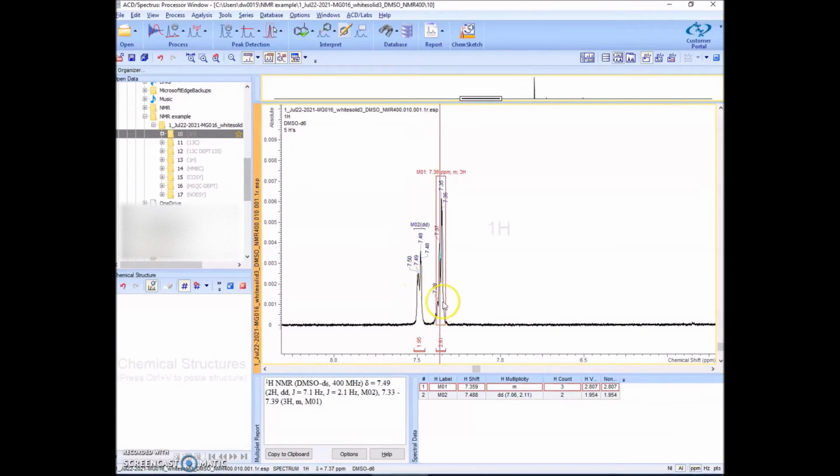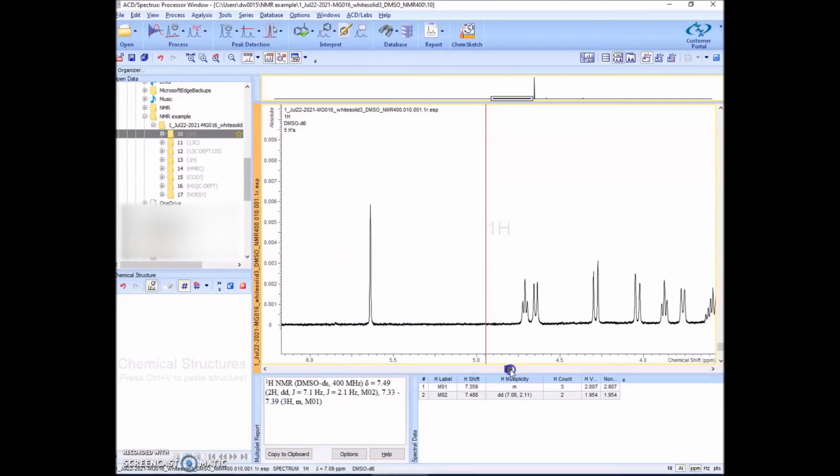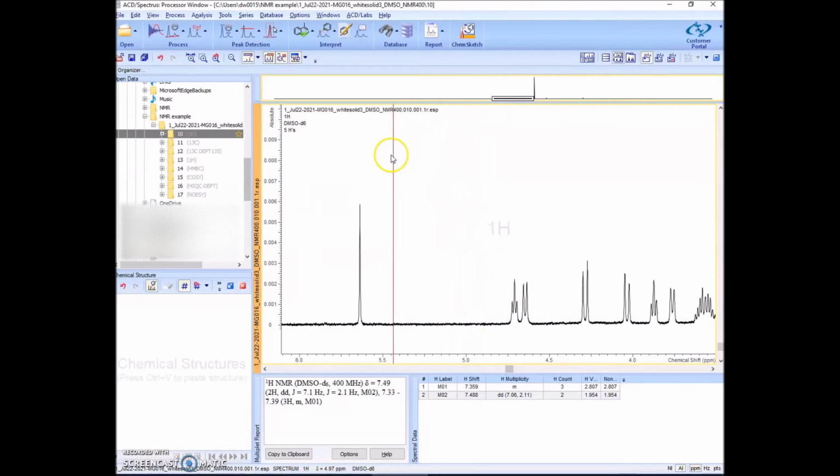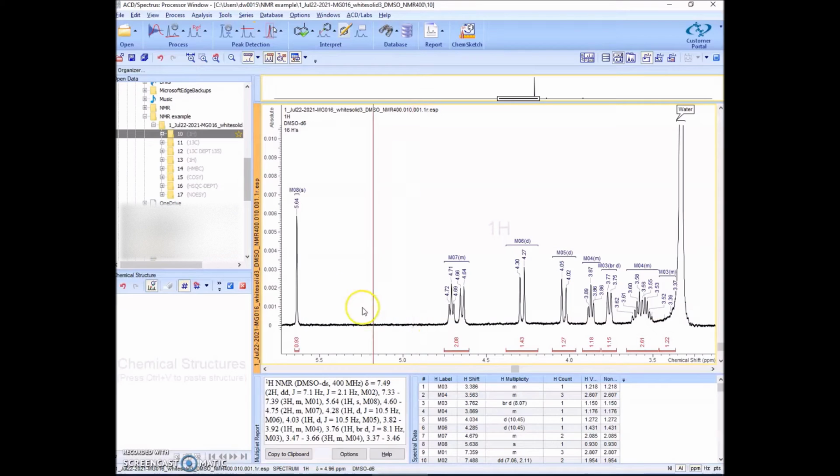Now all the peaks above that line are labelled, and that's going to come in very useful when I move over to assign the smaller peaks as well. So I think I will just do all of those at once. So choose that tool again, make sure all of these multiplet peaks are included but none of the noise. Click it there, and you see rather than doing them one by one, it's now detected every single multiplet.